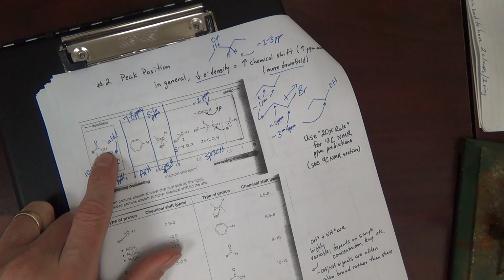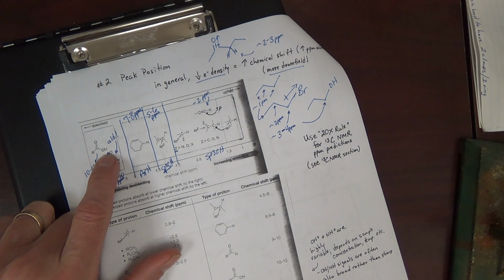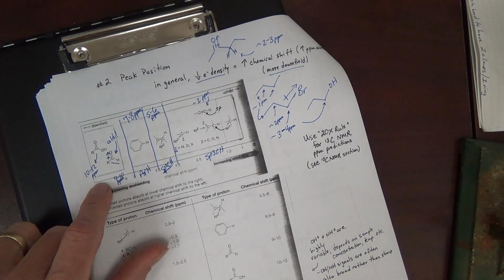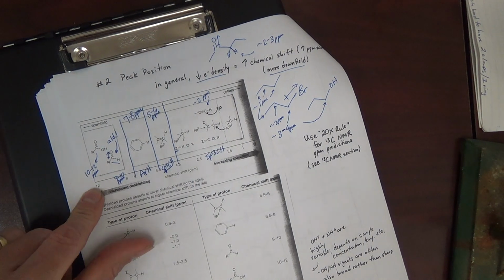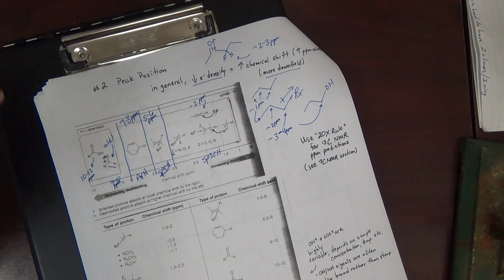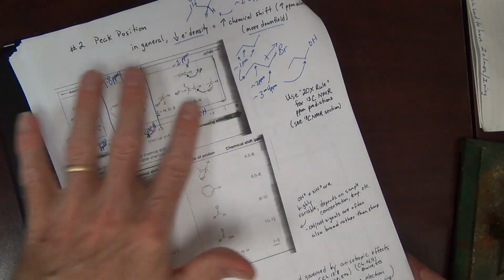When H's are on oxygens or nitrogens, the peak position can actually vary somewhat. All right? And tables are a little bit less reliable, or they're going to give you a broader range. Carboxylic acids, though, I've seen something 14, 15 ppm, way downfield. Kind of odd. All right, that's the general range. Most protons are going to be those types.